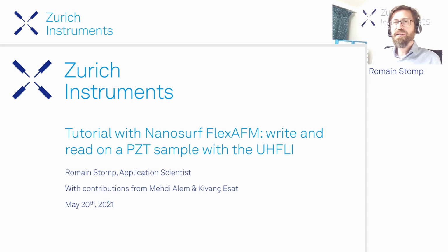So we already had a fantastic talk this morning on PFM. So let's change the topic a bit, using a piezoelectric sample such as PZT to illustrate some points of this tutorial. The idea is to take advantage of both an arbitrary waveform generator and a lock-in amplifier in the UHFLI, and then combine it with a FlexAFM.